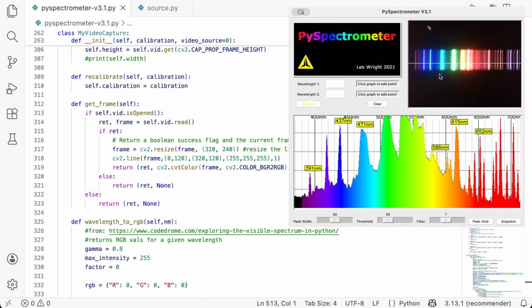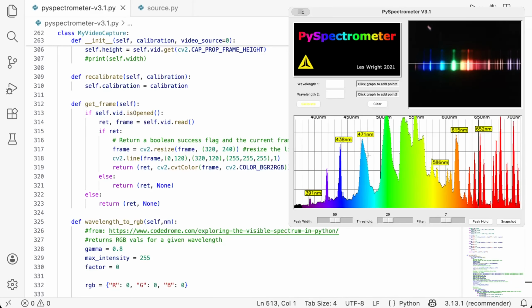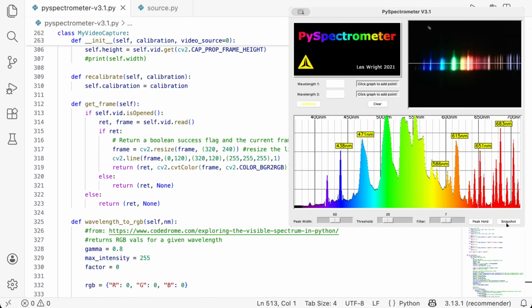It can show the raw data from the camera. It can show the wavelength. I can adjust the brightness. Apparently now it is too bright. I can just move the spectrometer to a different position. For example, this will be better. And now let's return to the code.